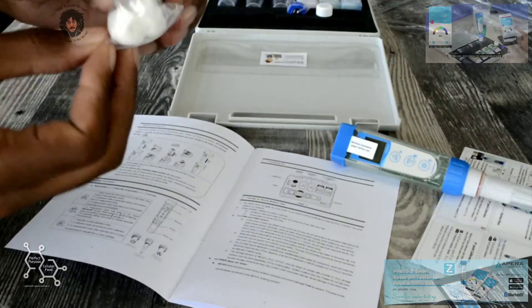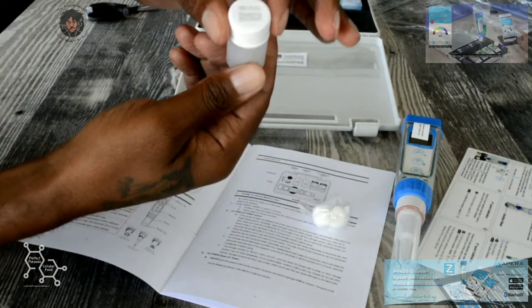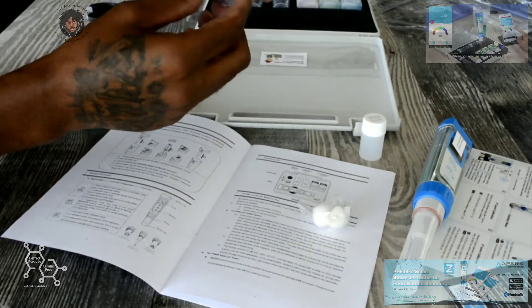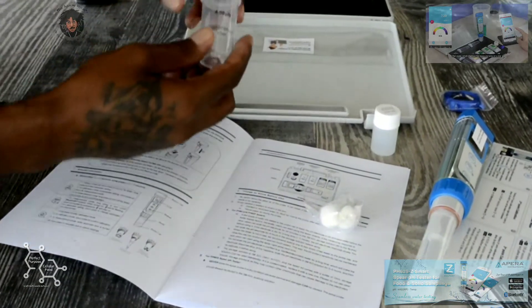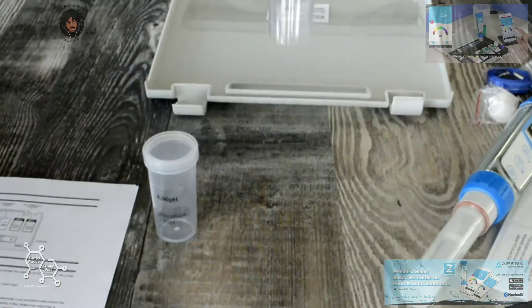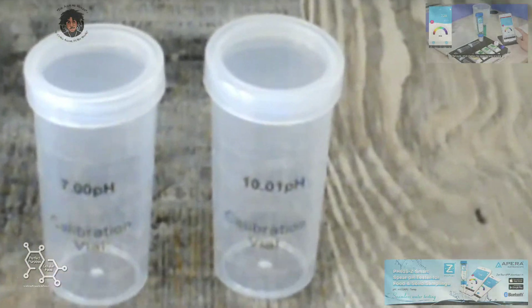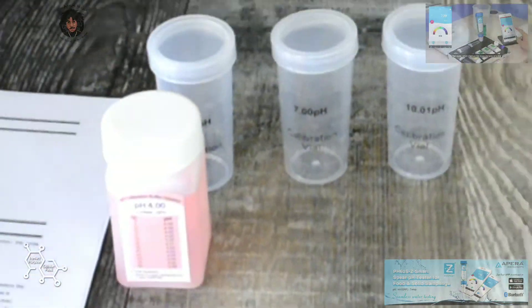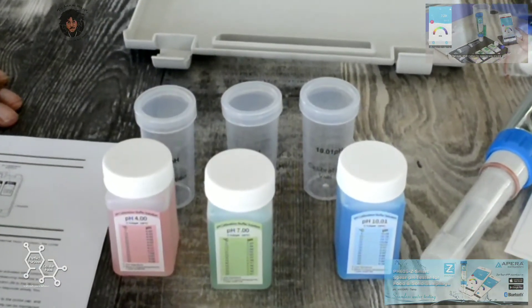We got some extra cotton balls right here — once this one gets worn out we have some more soaking solution as well. It looks like a little belt clip or keychain clip. We have the 4.00 pH calibration buffer, the 7.00 pH calibration buffer, the 10.01 pH calibration buffer, and here is the calibration buffer solution for pH 4.00, same for the 7.00, and then the last one for pH 10.01.